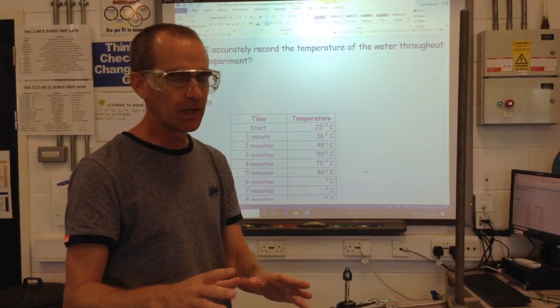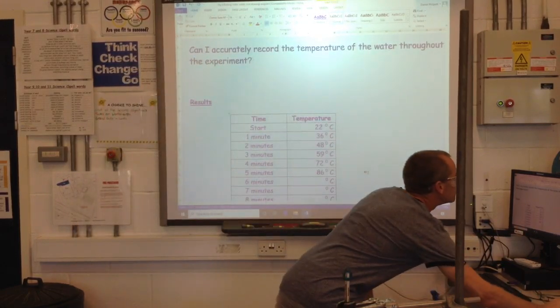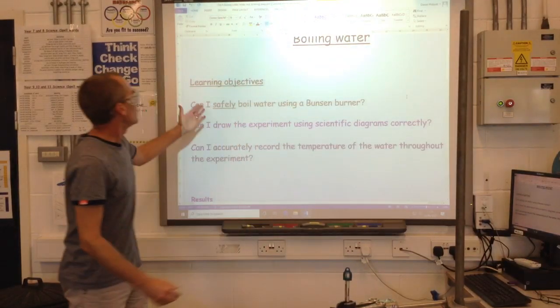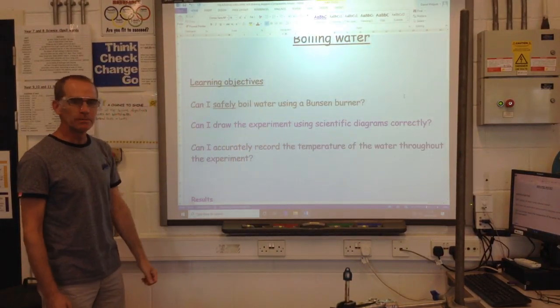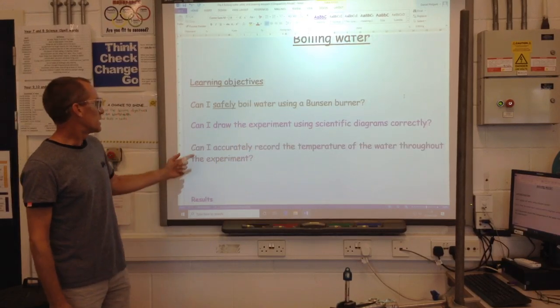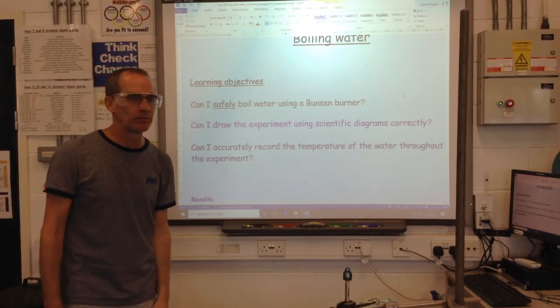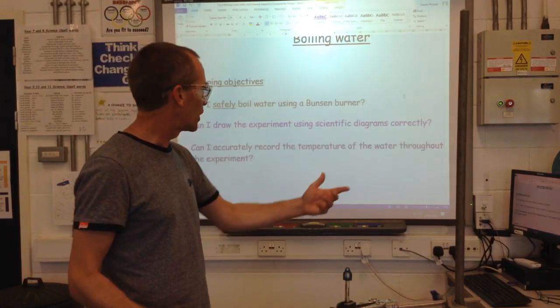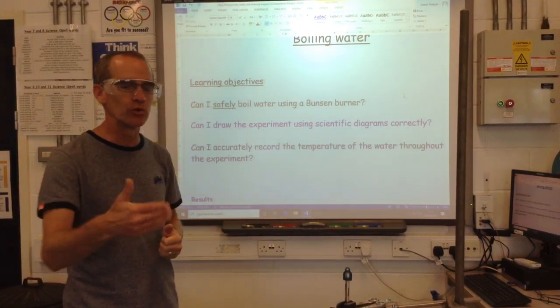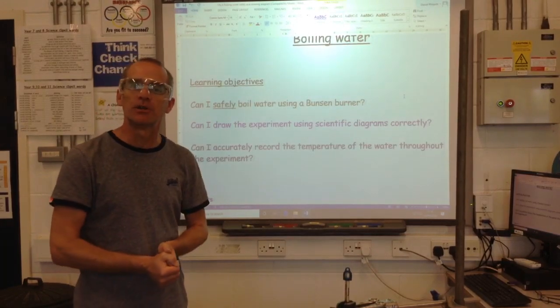So hopefully now you've seen how we would safely boil the water. You've seen how to draw up the scientific diagrams, and hopefully you'll be able to accurately record the temperature throughout the experiment. I've attempted to do the diagram whilst doing the recording — you would probably do the recordings and then draw the diagram after the experiment. Okay, that's it everyone, thank you.